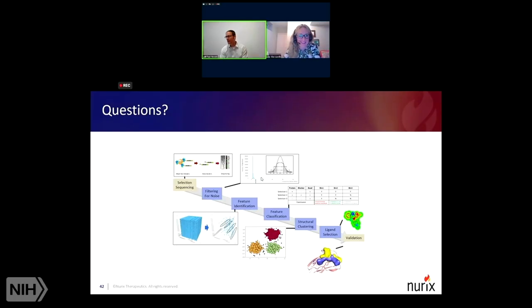So I think if you consider how you're running your replicates, it can affect this, right? We've certainly seen, when we had target titration replicates where we have a high protein loading and a low protein loading, that one or another of those replicates will be much more productive, and in evaluating the SAR we'll have a lot more faith in following up on that.